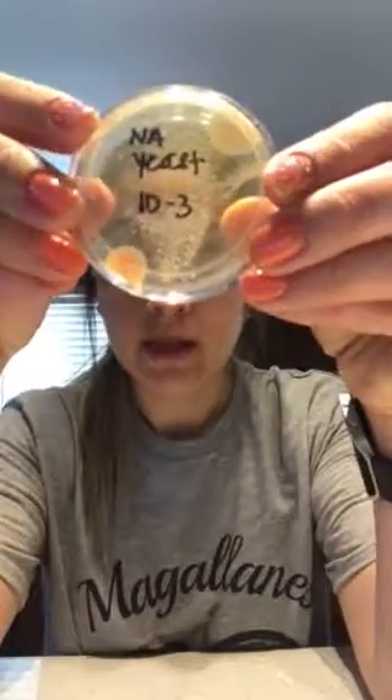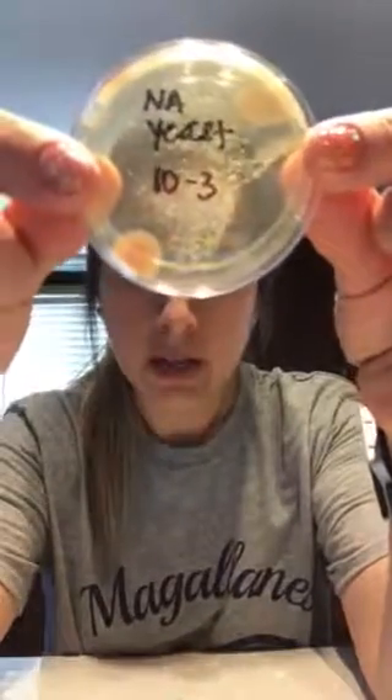So that one is also too numerous to count. With 10^-3, you can see more of the colonies, and I think we'd be able to count them; however, it is too numerous — more than 300 colonies for sure. I did find it interesting that we had some growth with different colors on that one.